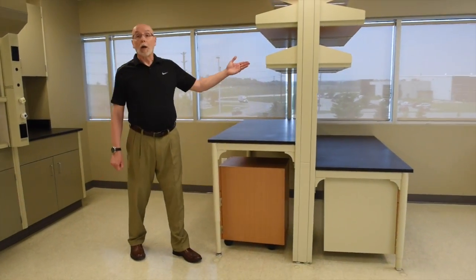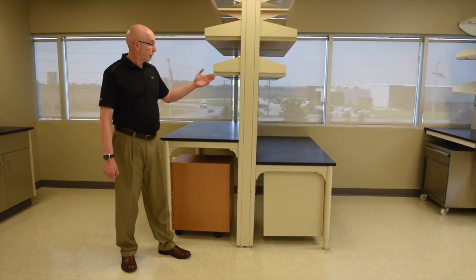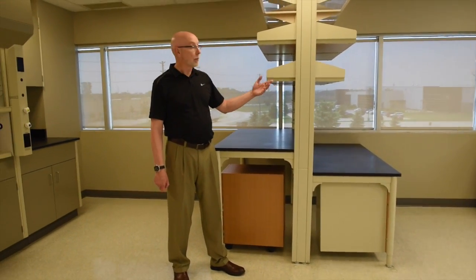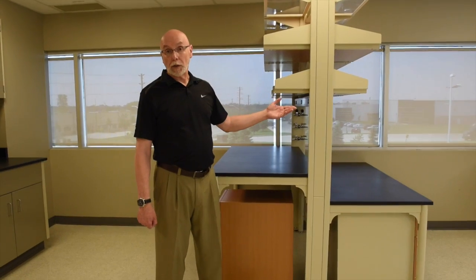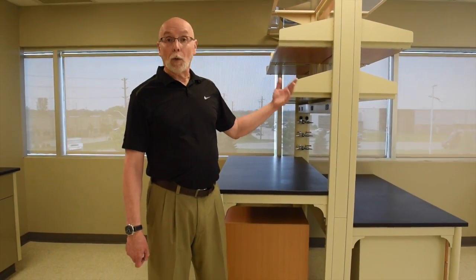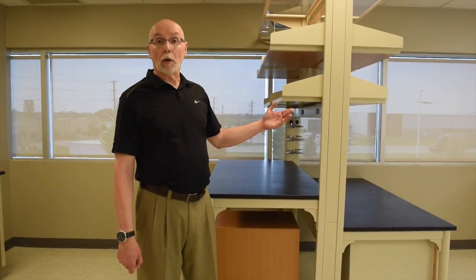This is the Mott Optima 2550. If you want to learn more about it, you'll see pictures, catalog, etc. on our website at www.mott.ca. It also has a dealer map there where you can become acquainted with contact information for our really super dealer organization. Thank you.